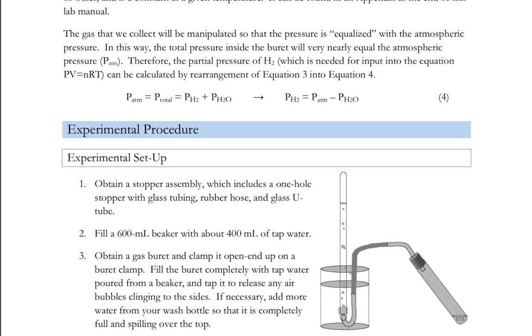Now the water will stay put in there, but once we hook up our reaction, which produces a gas, that will be hooking up the test tube that's on the right in our diagram. We will have a pathway from our test tube to our burette, and the reaction producing H2, that H2 is forced into the burette, which displaces water, and the volume of the gas produced is what we will measure. We will be comparing that to what we calculate.